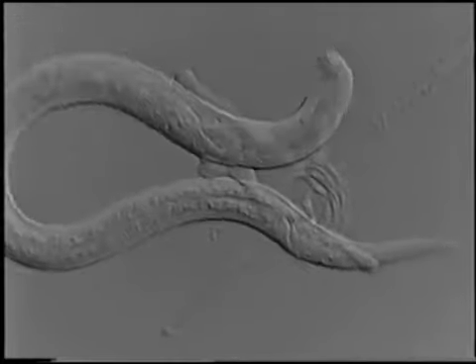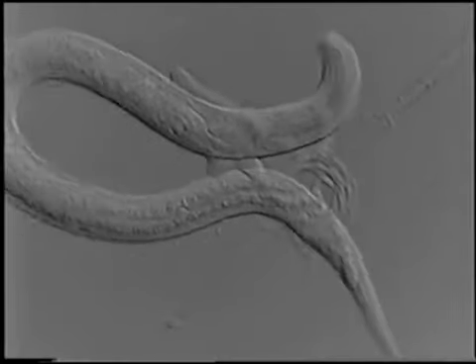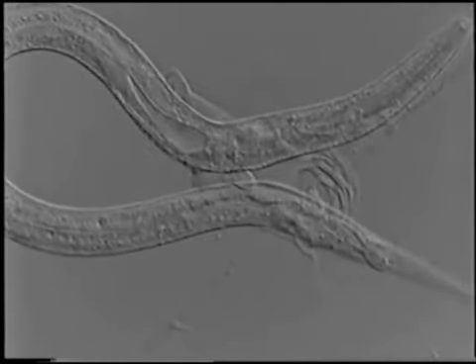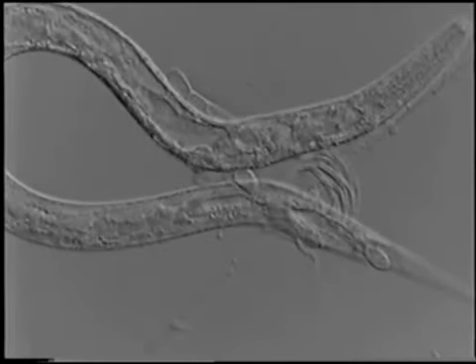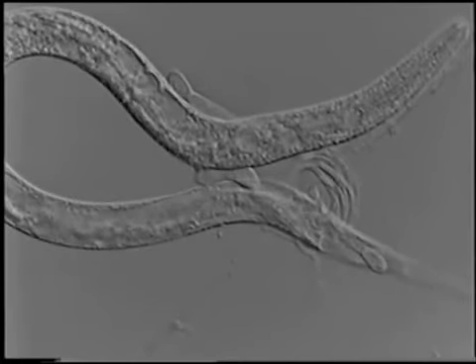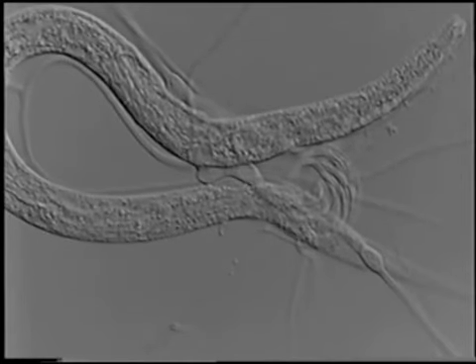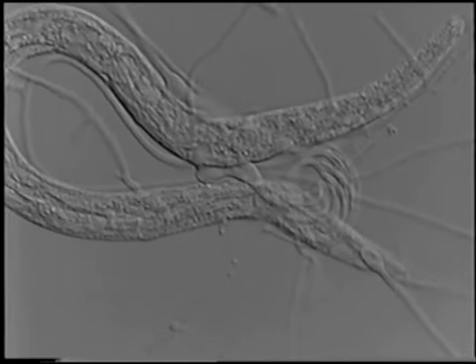The infection process is now seen in a sequence lasting 36 hours. During the nematode's futile struggles, hyphae penetrate through the cuticle. The traps become vacuolated and trophic hyphae proliferate within the nematode. The nematode is digested and its contents absorbed. At the same time, the external mycelium develops further and traps are formed in the vicinity of the nematode.